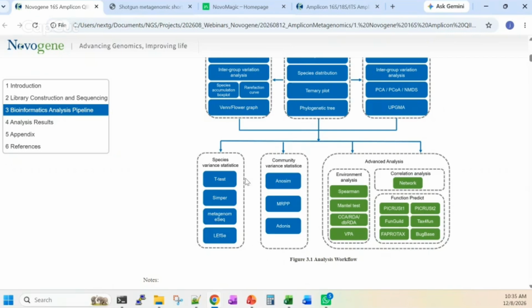So we will have statistical numbers or metrics on those comparisons. Other than that, of course, we can do more from alpha diversity and beta diversity and comparisons. For some projects, when we want to look deeper inside, we can also perform some functional predictions.